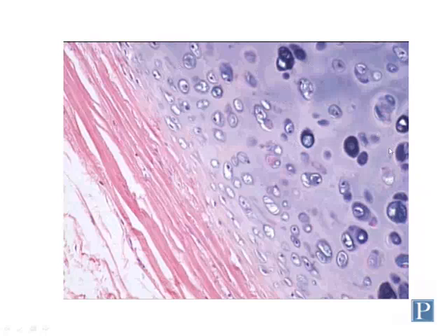So this is mature hyaline cartilage out here. This region is called the chondrogenic zone. This is called the chondrogenic zone because here's where you have chondrogenic cells that are constantly proliferating, producing new cells. So most of the cell growth occurs in this area in the chondrogenic zone by cells called chondroblasts. So you find chondroblasts in this region of the cartilage.